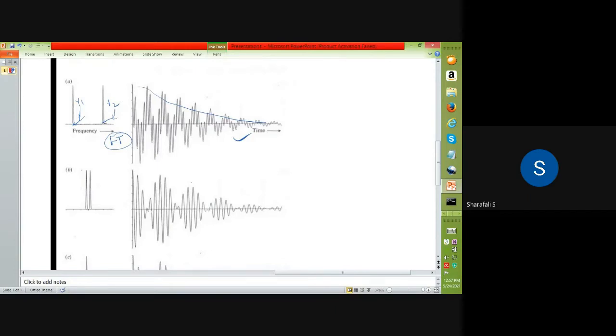If instead of mu1 and mu2 we have, let's say, mu3 and mu4, different frequencies, and we convert that from the frequency domain into the time domain, then we get a different spectrum, as you can see from here, because the frequency is different. The decay effect is the same because the line width of your spectra is the same as before.